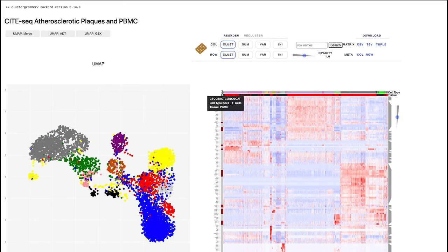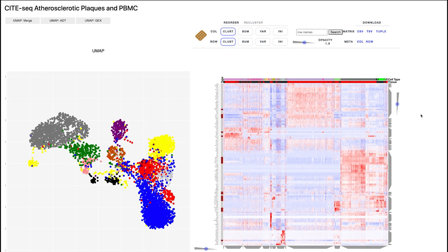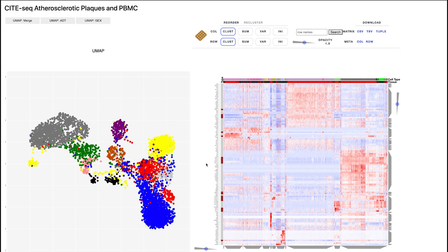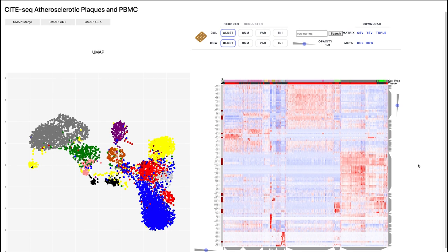We're going ahead and visualizing the most variable genes across that dataset and all protein markers. For this dashboard — which is also available on MyBinder — you'll notice a lot of similarities between the CityBike example and this dataset. We have a UMAP representation of our data. The important thing to note is that underneath this is just a plain Jupyter notebook — we're just converting it into a dashboard using the Voilà dashboard library. You can find the Jupyter notebook on our GitHub page.